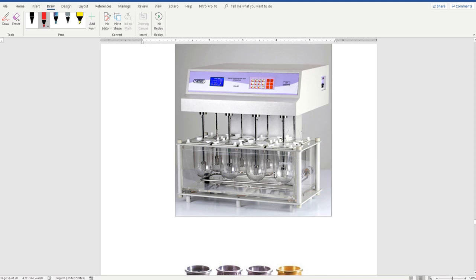Hemispherical يعني شبه دائري. Now all these vessels are in a water bath. This is the water bath, because I need to control the temperature of the medium inside the vessels. إذن في water outside the vessel with controlled temperature, and that is to control the temperature of the media inside the vessels.